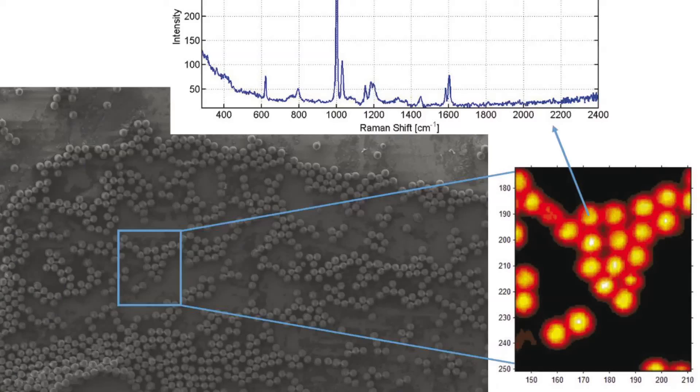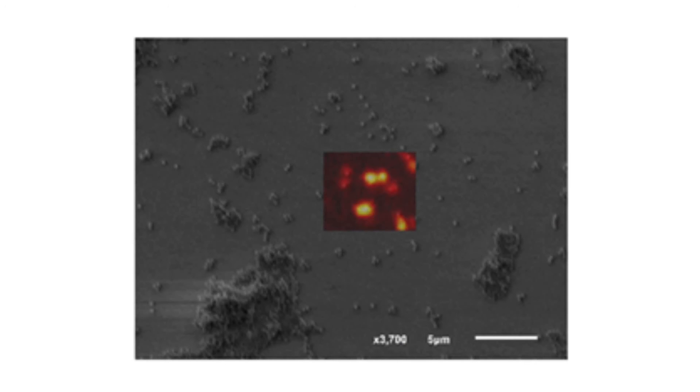The Raman image of polystyrene beads is directly correlated with the SEM image. Isolated beads as small as 280 nanometers can readily be detected.